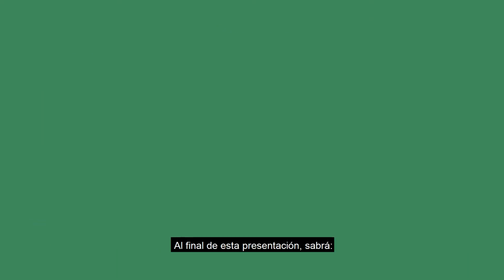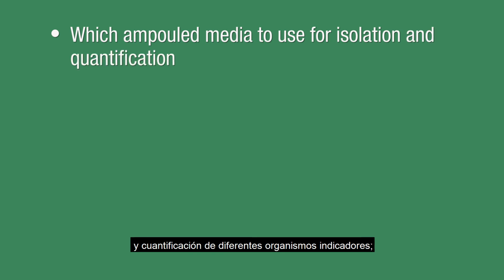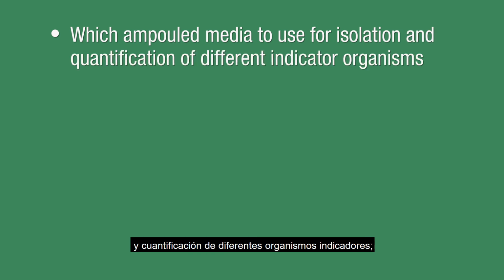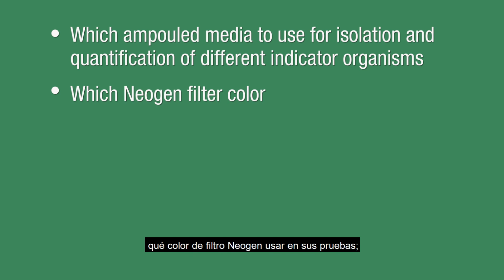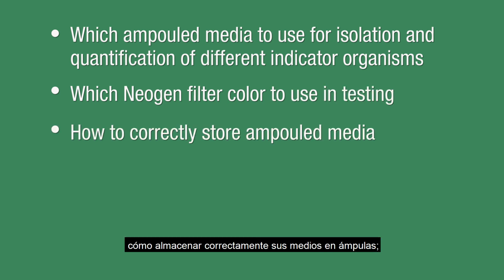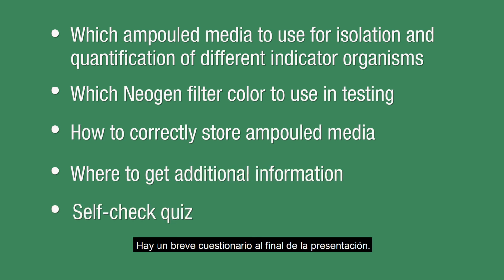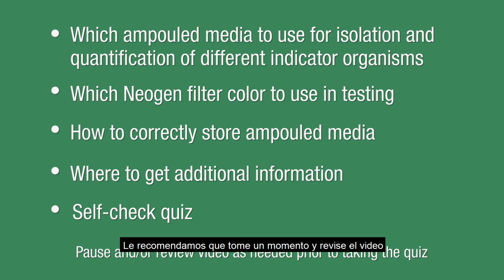By the end of this video, you will know which ampule media to use for the isolation and quantification of different indicator organisms, which Neogen filter color to use in your testing, how to correctly store your ampule media, and where to get additional information. A short self-check quiz follows the presentation. We encourage you to pause and review the video as needed prior to taking the quiz.